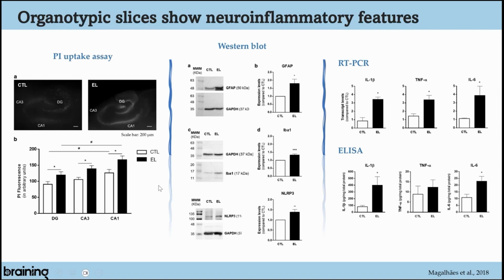So epileptic-like slices also have an increase in cell death, which was assessed through this propidium iodide uptake assay in all areas of the hippocampus.